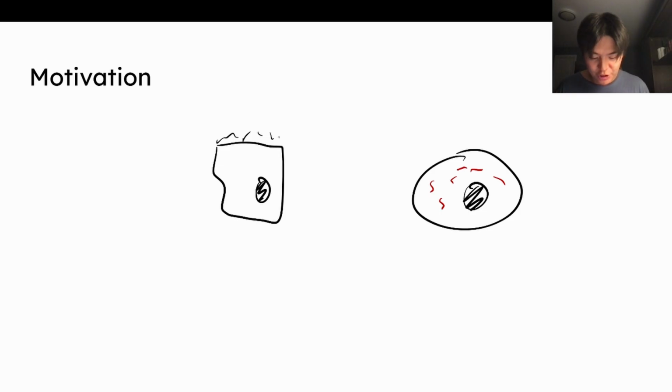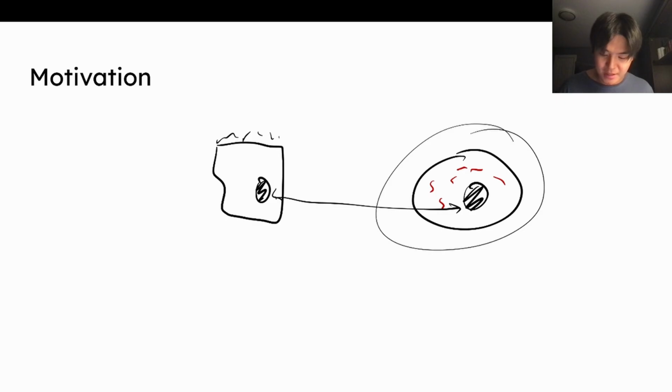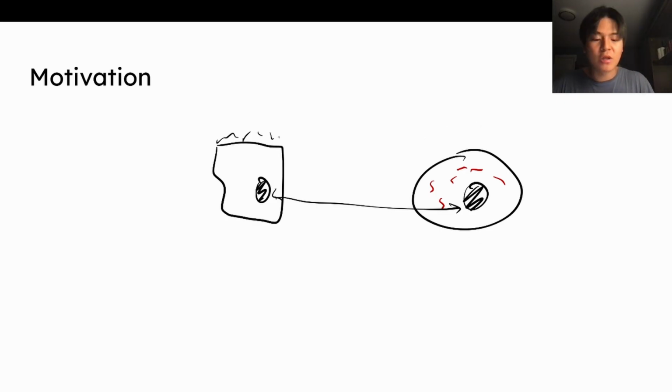Remember, we share the same genome, right? We share the same genome, but the gene is only being expressed in our pancreas cell. So obviously here, we don't want to use the Southern blot. That wouldn't make sense because we would get a positive result for both. Instead, we want to look at the RNA because this guy will have RNA for insulin, whereas this guy won't. Or maybe he will for some reason, but it will be a lot less, right? And that's the whole idea.